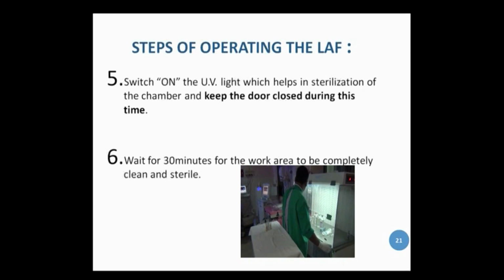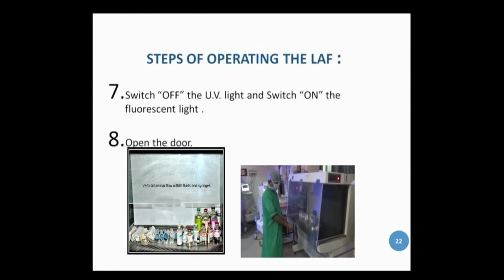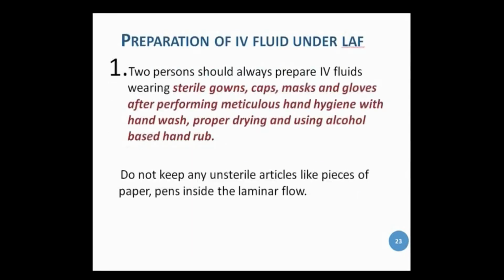Step number 6 is wait for 30 minutes for the work area to be completely sterilized. Step number 7. Switch off the UV light and switch on the fluorescent light. Step number 8. Open the door.